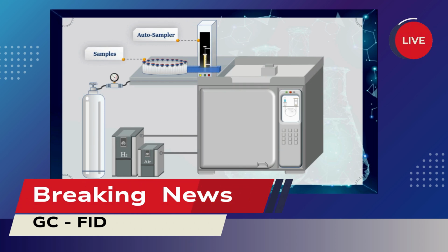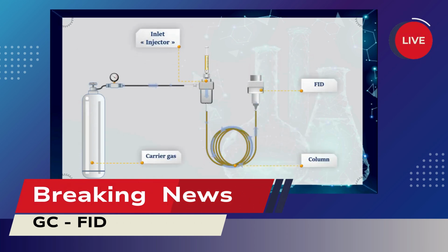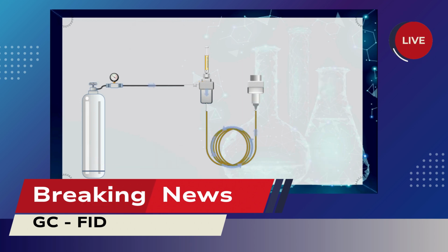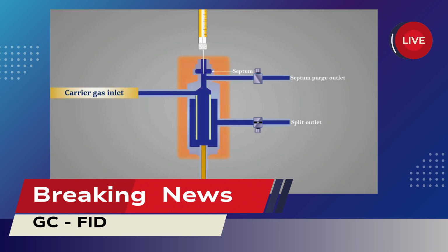Samples are introduced into the system through an auto-sampler or manually using a syringe. The injector, a heated chamber, volatilizes the sample and its matrix. In split mode, a portion of the sample is diverted out through a split vent. In splitless mode, the entire sample enters the column.